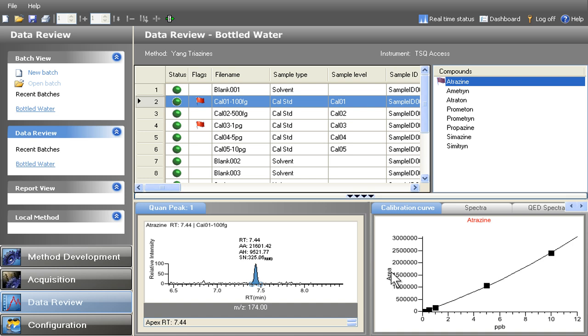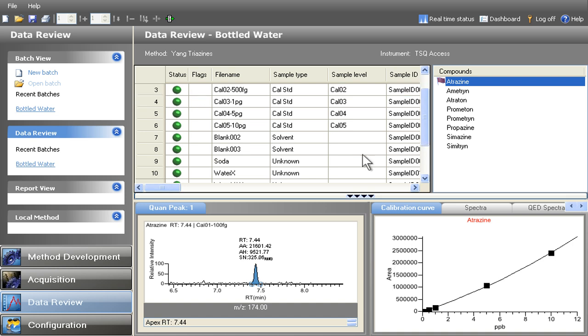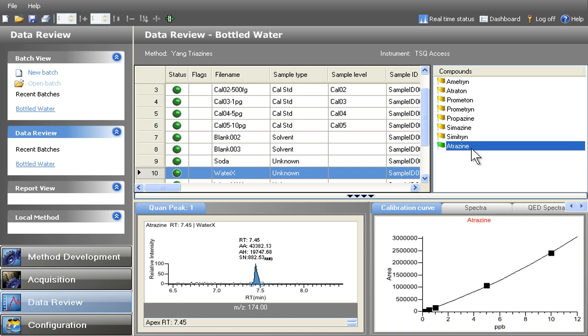When investigating unknown samples, TraceFinder clearly flags any analytes that are above or below a user-defined limit.